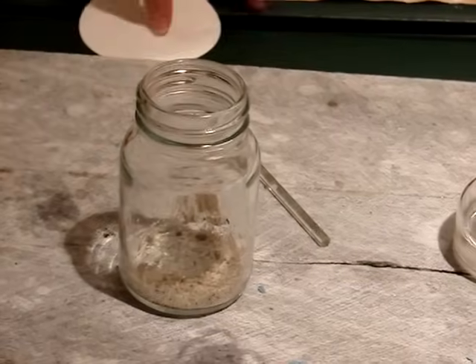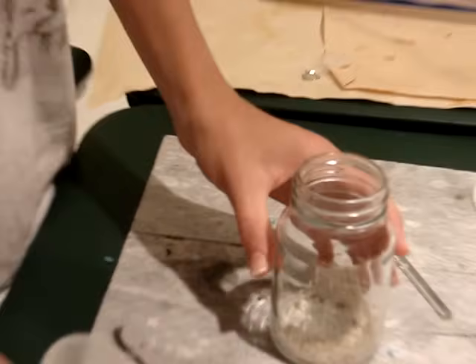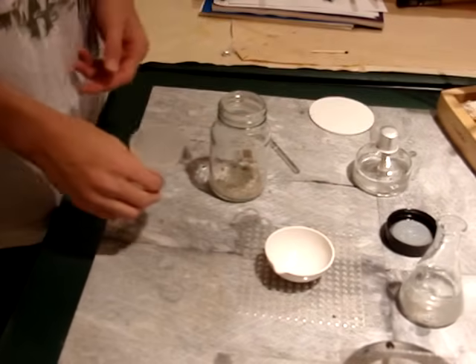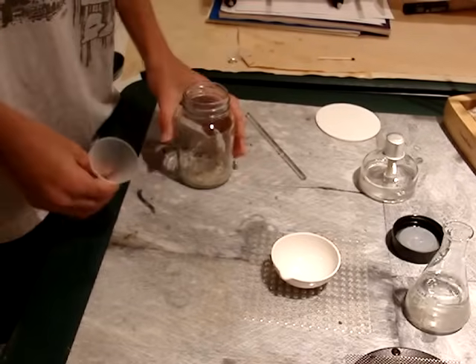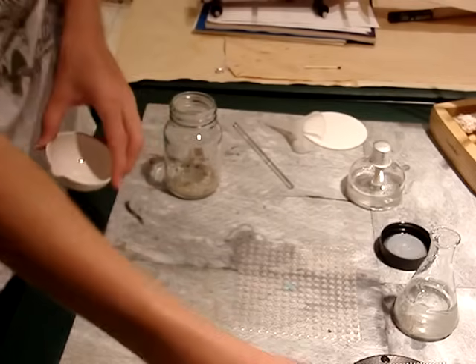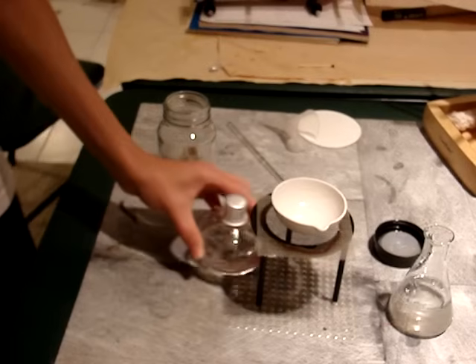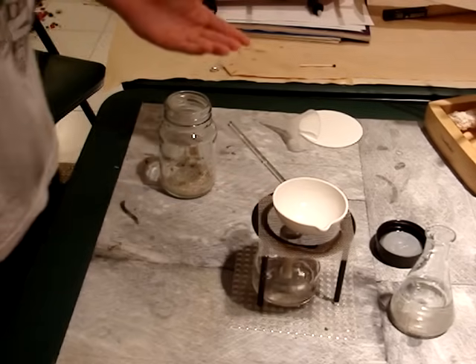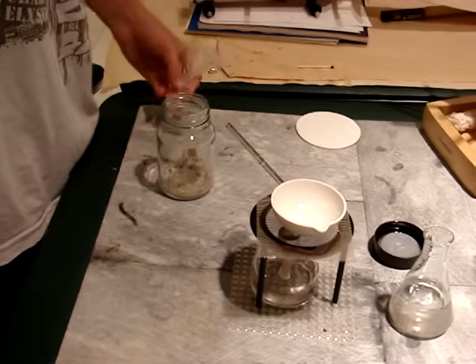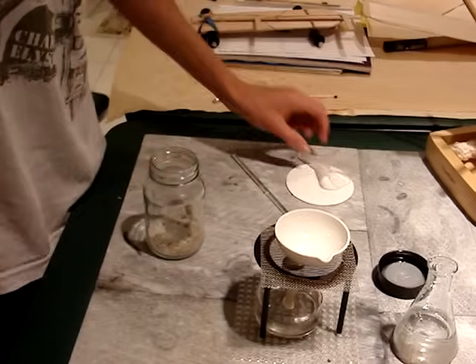Then I'll filter it with this filter and fold the filter paper over it, and I'll filter it into this cup. The sand will get left behind in the filter paper, and some sand will be left in the jar, and I'll just have salt water left in the evaporating dish. And then I'll put that on the Bunsen burner. Not Bunsen burner, I have an alcohol burner here. I'll put that on the alcohol burner, light the burner, and all the water will evaporate, and I'll have salt left here and sand left in the jar and the filter.